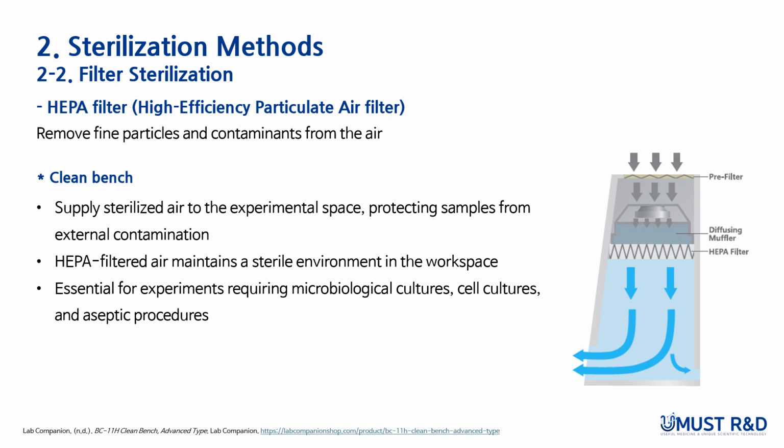One filter sterilization method is using HEPA filters. HEPA filters can remove fine particles and contaminants from the air. A clean bench, which uses HEPA filters, is an essential piece of equipment in microbiological experiments. In the clean bench, sterilized air is supplied, protecting the samples from external contamination. It is essential for experiments involving microbial culture and aseptic operation.